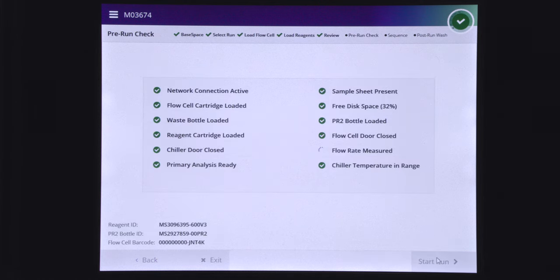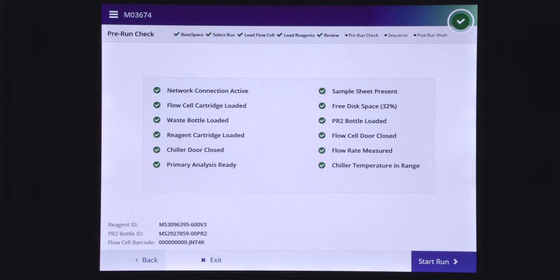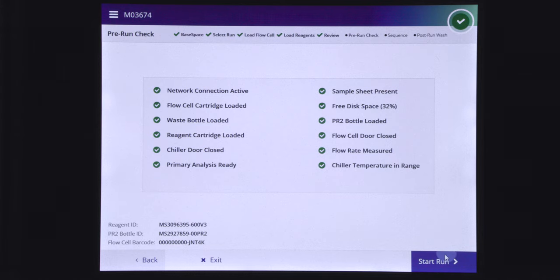At this point, the system performs a check of all run components, disk space, and network connections before starting the run. If any items do not pass the pre-run check, see Resolve Run Setup Errors in the MySeq system guide. When all items successfully pass the pre-run check, select Start Run.